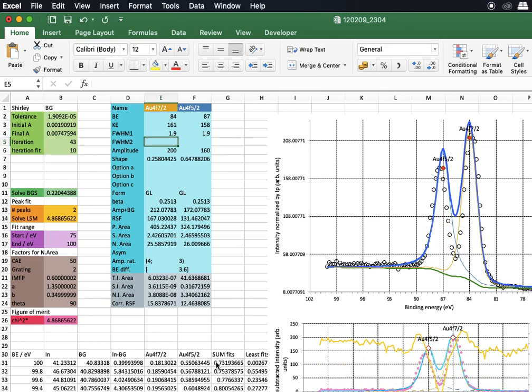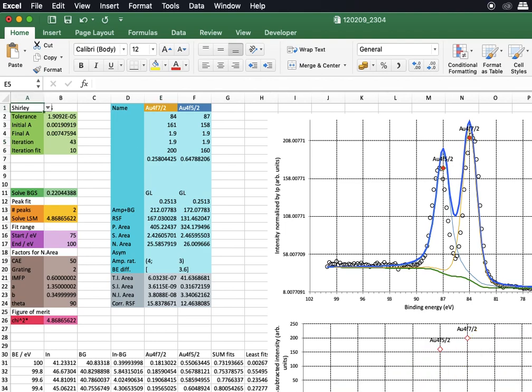So it's almost okay, so easy to fit. But now the peak form is the Gaussian-Lorentzian convolution. It's taking more time than the Gaussian single peak.